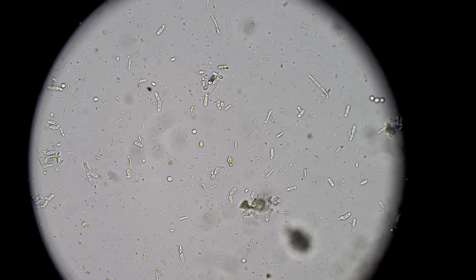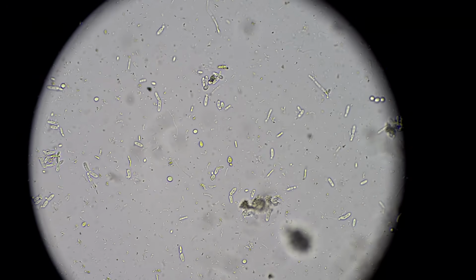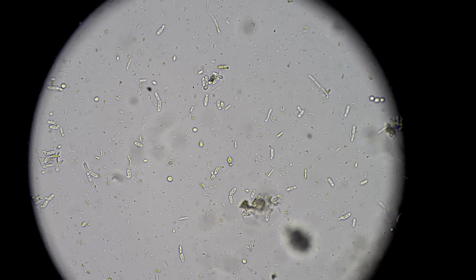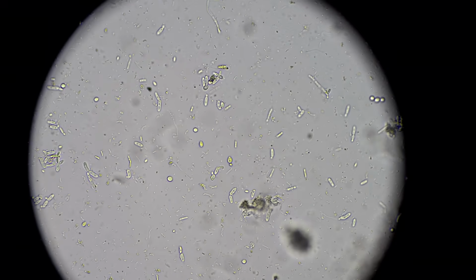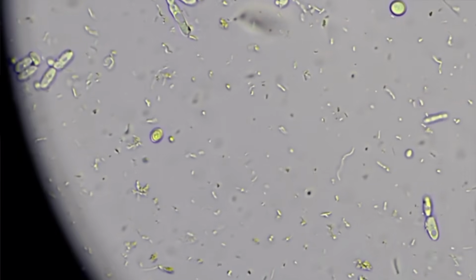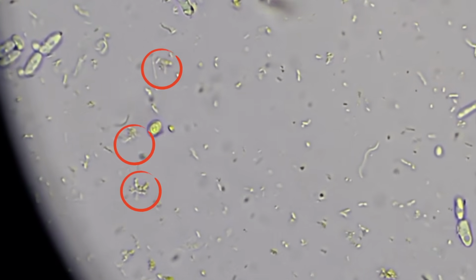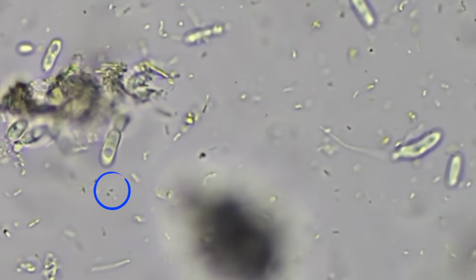All right, now, if we look really closely, we can see some star patterns. Some rods are connected at one point, and they kind of create a star pattern. And that is most likely purple non-sulfur bacteria. We can't definitively know unless we grab that specific microbe and then DNA test it. But we go off morphology. This right here down the bottom left quadrant, here and here, they both look like they are likely purple non-sulfur bacteria. But we've got a coccus right here doing horizontal gene transfer.